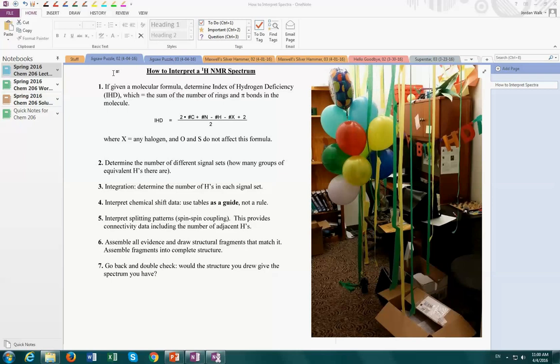All right, so today we're gonna spend it looking at NMR spectra and solving them. Our theme song today is "Jigsaw Puzzle" by the Stones. So this is very much a puzzle, and we're gonna have lots of little pieces of information that we're able to extract from our NMR spectra. And ultimately, we have to put the full picture together. It can be a little bit challenging, and what you'll find is as we solve problems, there are going to be themes that drop out. We're going to see similar motifs that always indicate the same thing, and so with practice, we should be able to solve these pretty well.